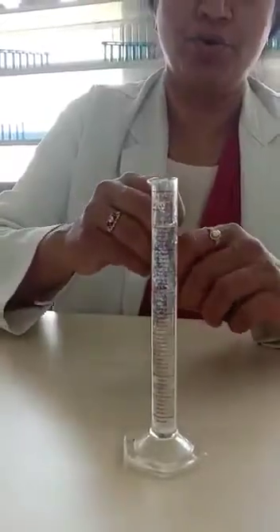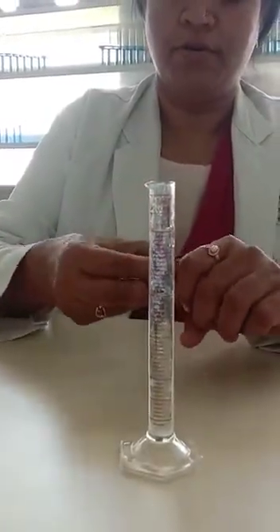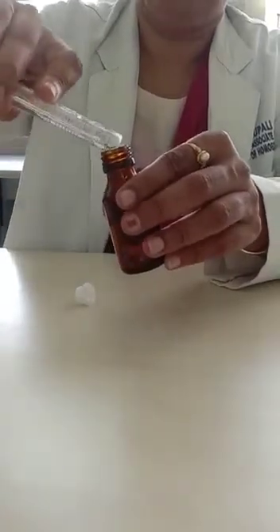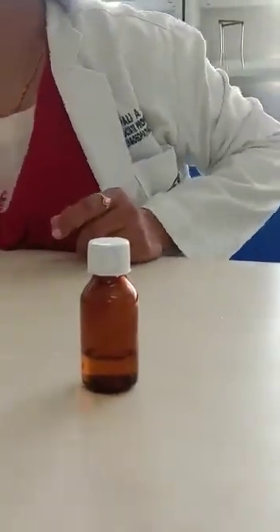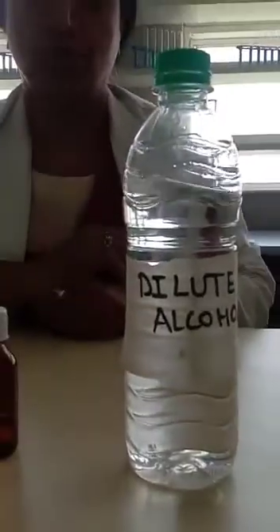After taking this, we are going to put this content in a glass sphere and we are going to mix it properly by shaking. After this, this is to be labeled as dilute alcohol. As we have labeled here, it is dilute alcohol.